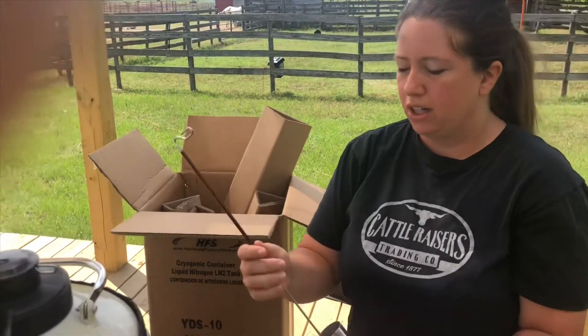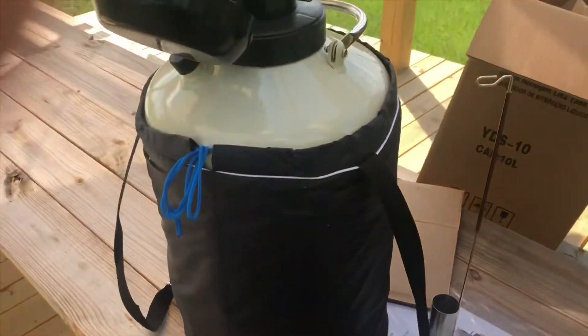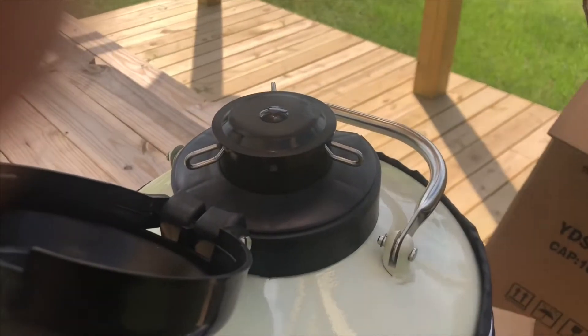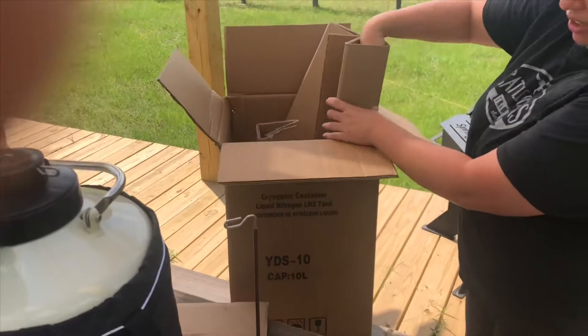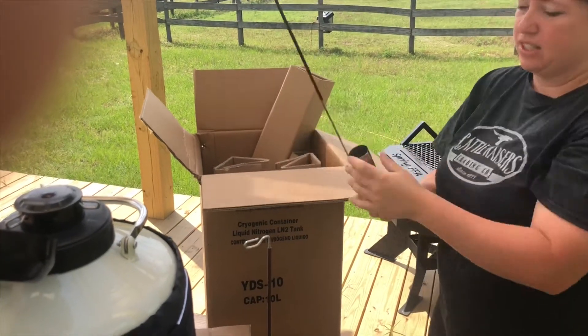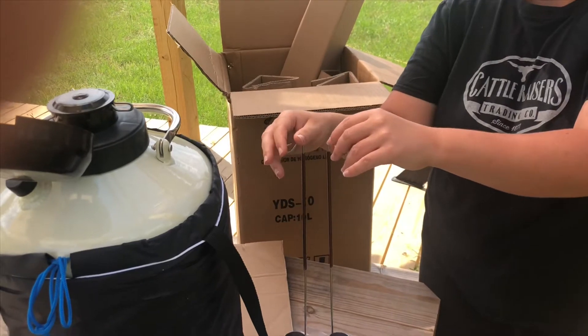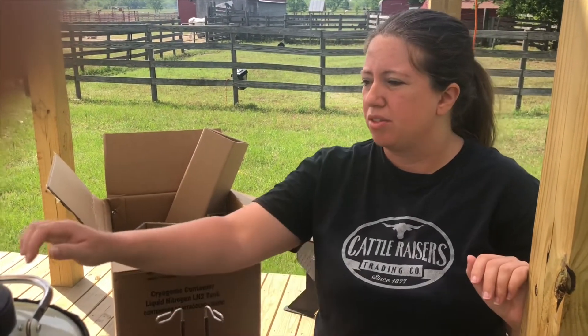It comes with six straw holders — I'll leave the last one out so if you have any questions about how it's used, you can see. We plan on using it probably within the next month.